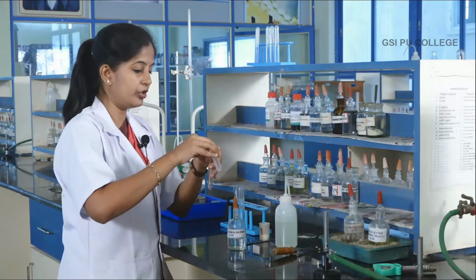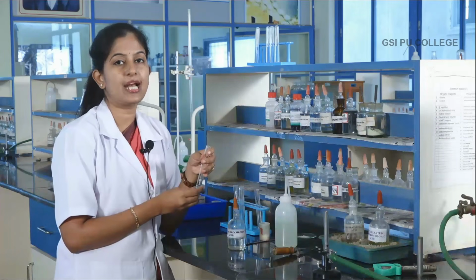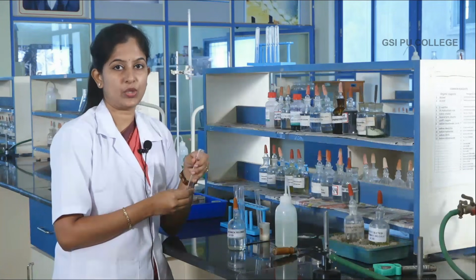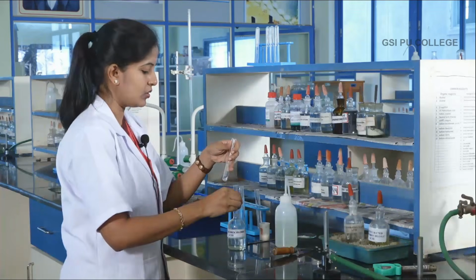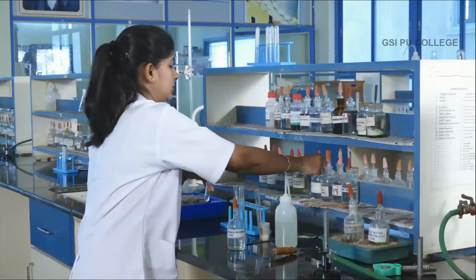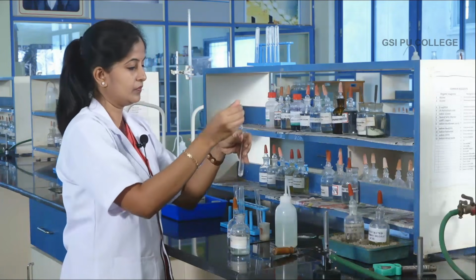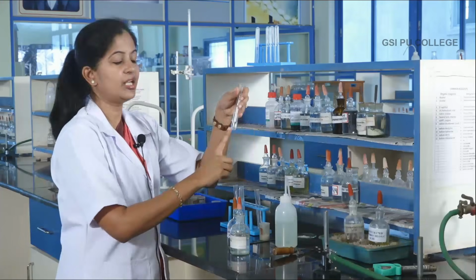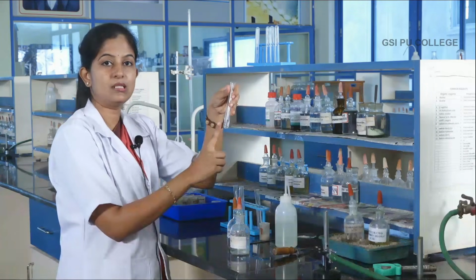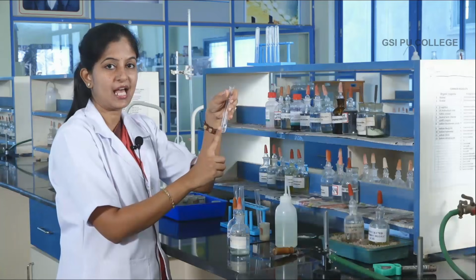Decant a small amount of original solution. Add the second group basic radical group reagent. So, what is the group reagent for the second group basic radical? It is dilute HCl followed by H2S, that is hydrogen sulfide. So, add dilute HCl followed by H2S. You can observe a clear solution, which means that there is no precipitation, hence the second group basic radical is absent.